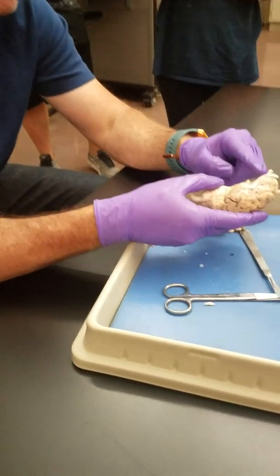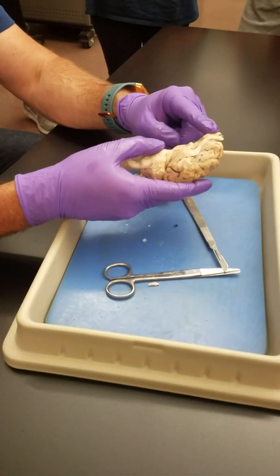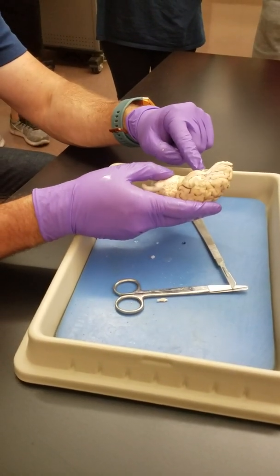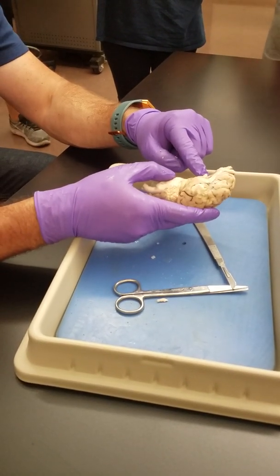Here you can see this is what's left of the olfactory nerve. Olfactory nerve is smell. Then that was the optic nerve we saw here. This here is called the optic chiasma.